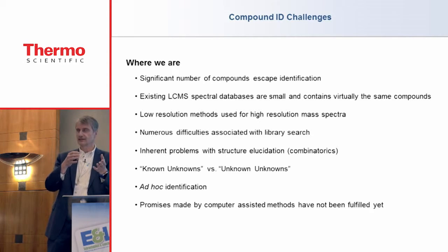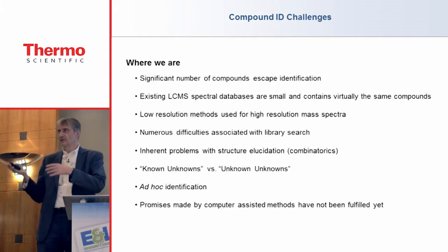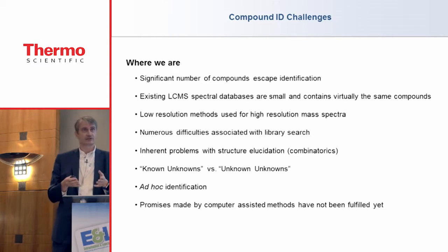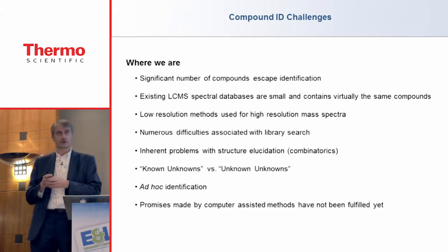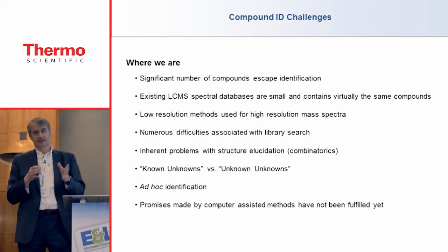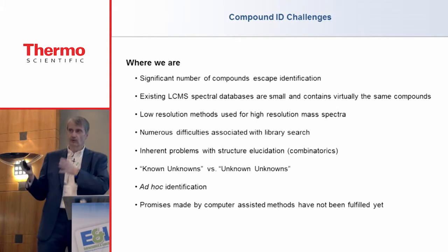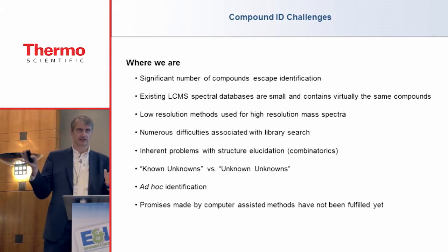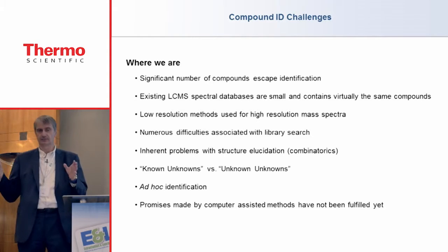There was a mass spectrometer on Jupiter falling down, and a mass spectrometer on Saturn's moon, and so on. Why can we not identify the compounds on Earth, when we have the sample and all these instruments? Why is it so complicated? I will try to explain why, but not make the complicated story even more difficult, so I will only focus on LCMS. I will not touch other analytical techniques like GCMS or NMR.